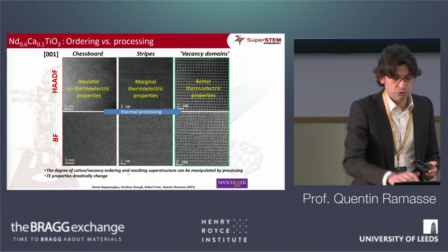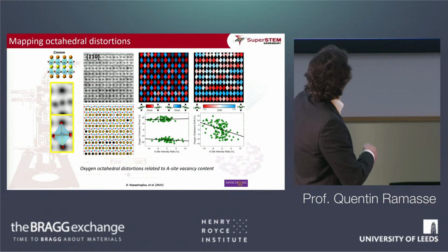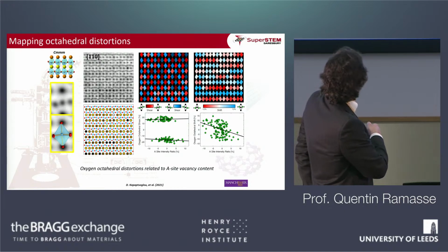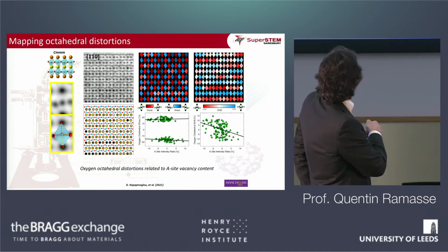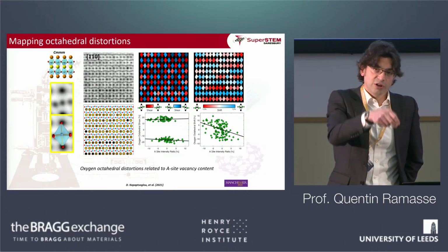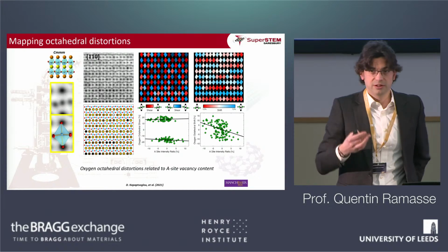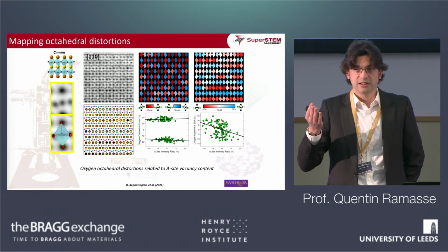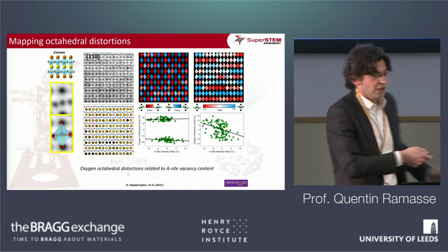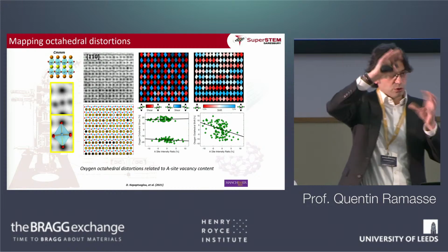So if you just do image analysis, you can realize that depending on where you look, when you invert the images this time, going from bright contrast noting where an atomic column is, to black contrast noting where an atomic column is, it's a different type of image, but you can understand it in inverted contrast fashion. Looking at how, depending on how much intensity there is on one particular column, the surrounding columns are tilted.